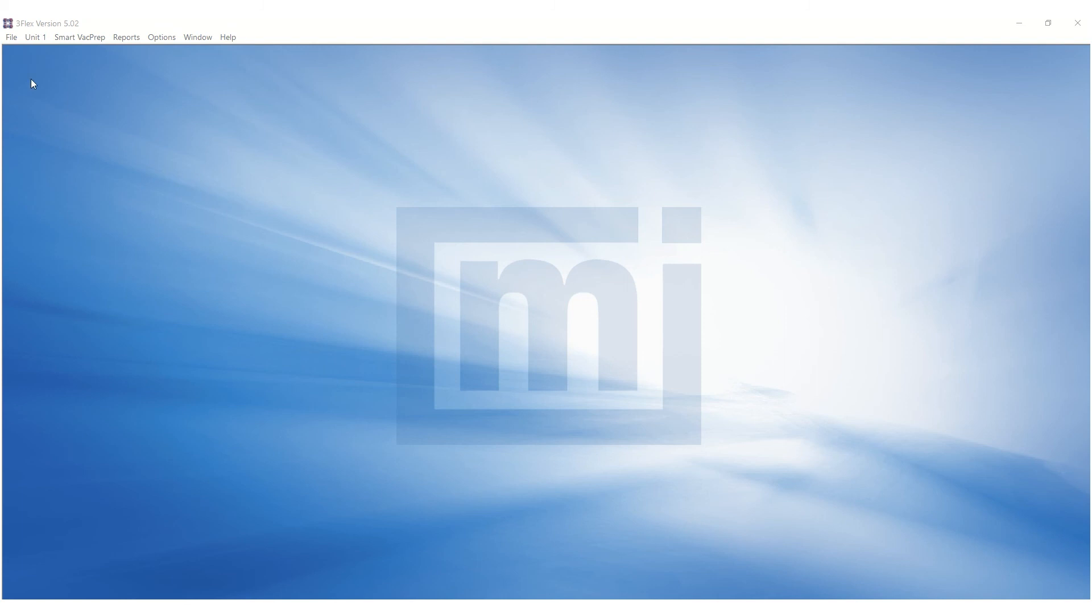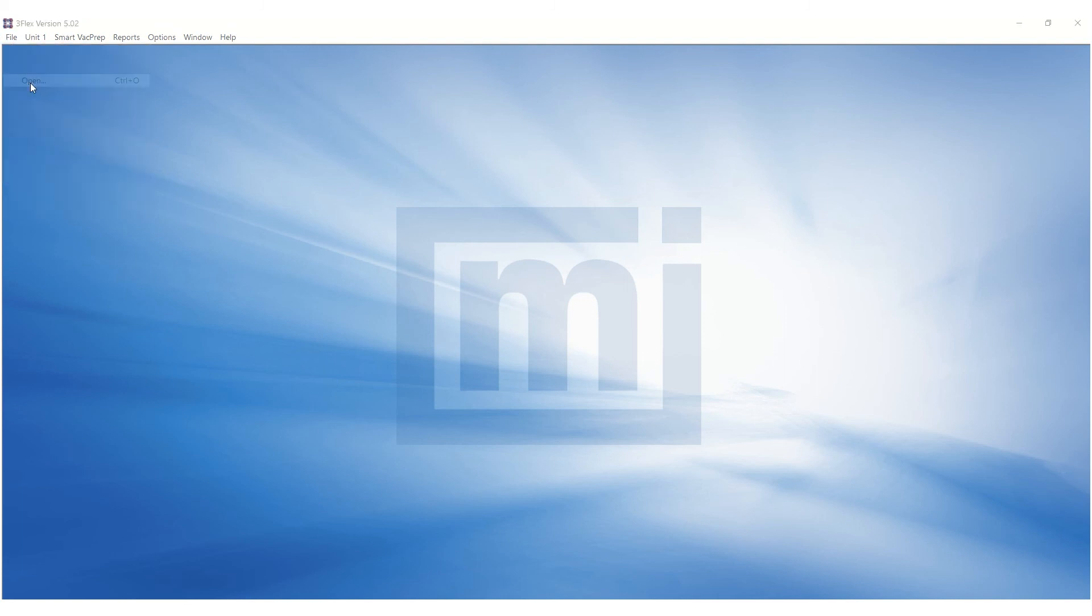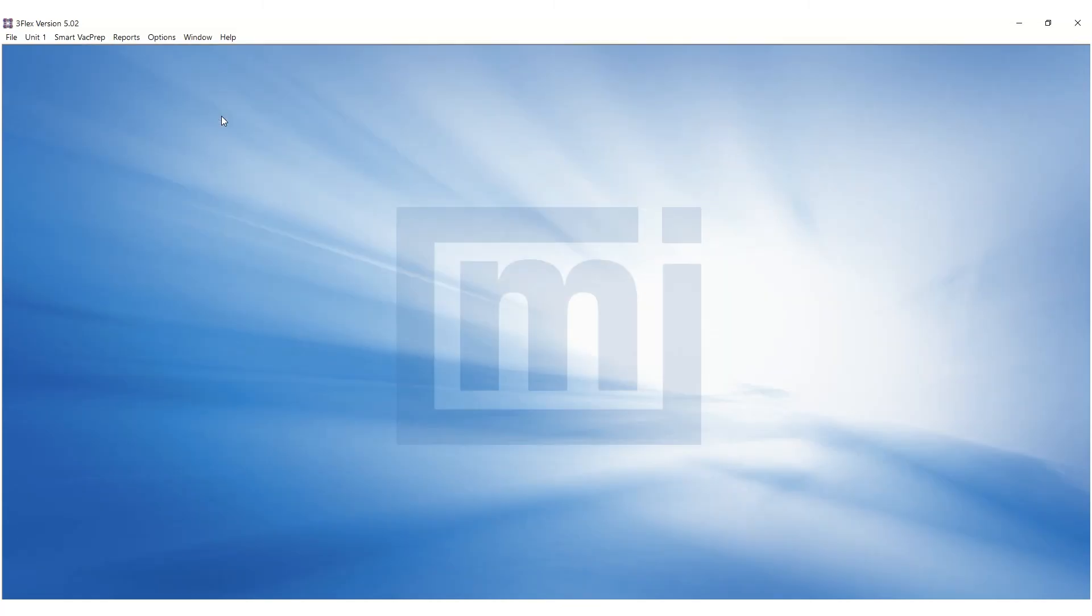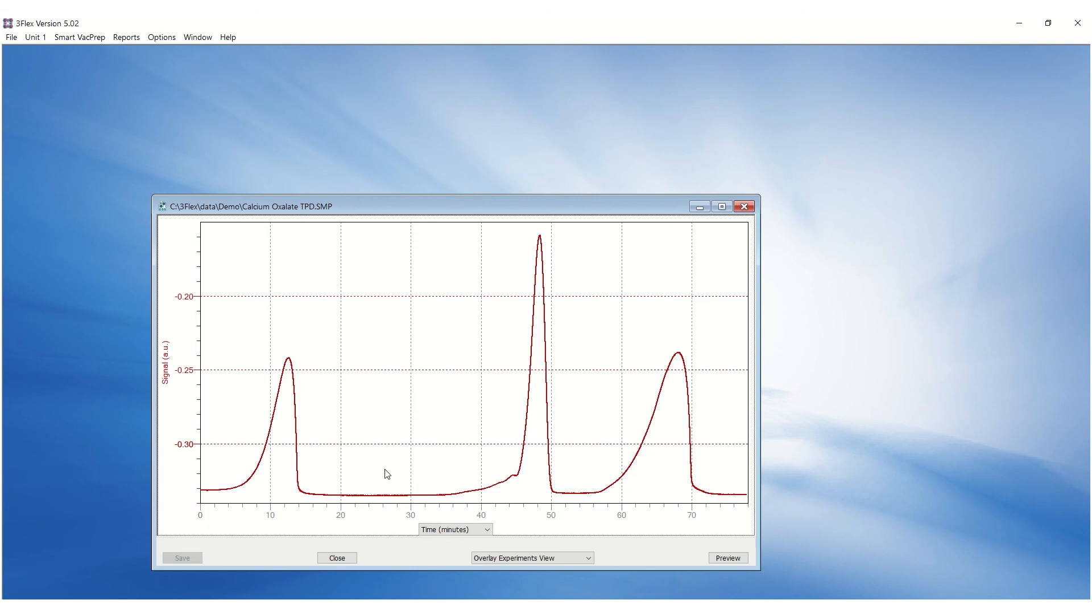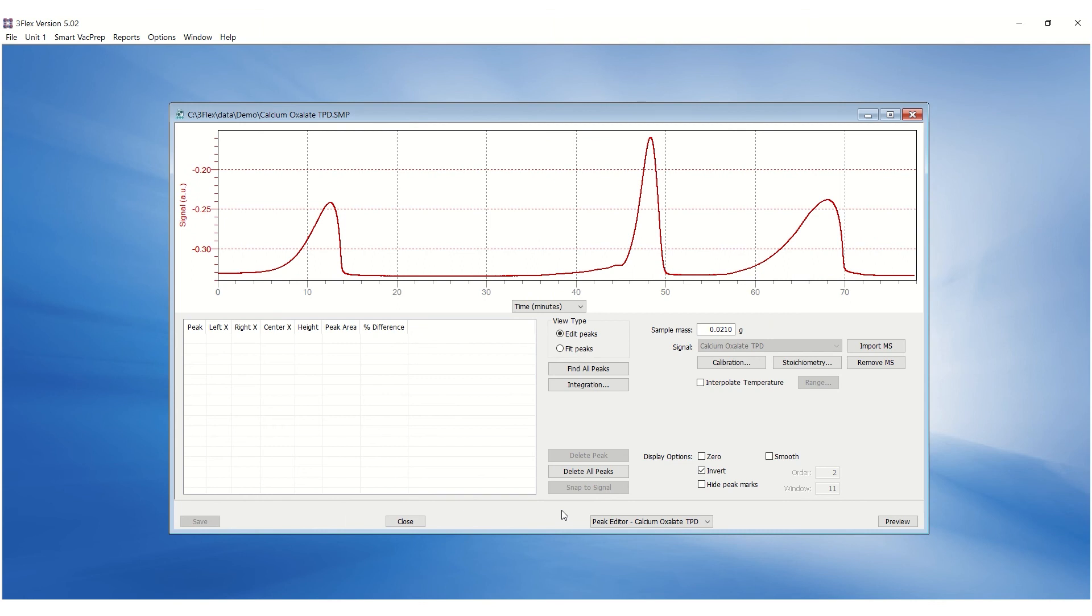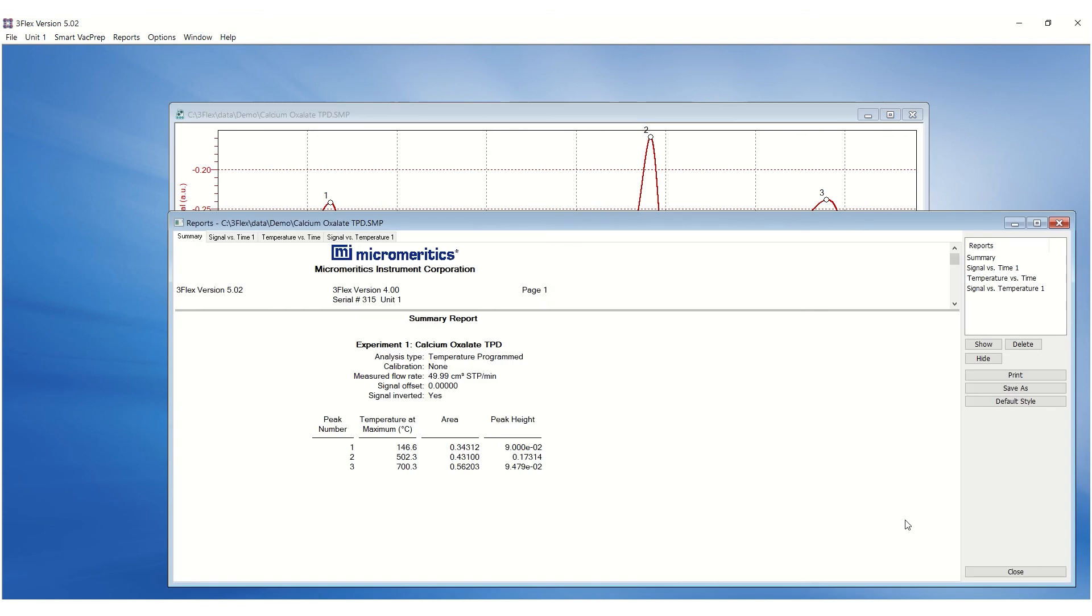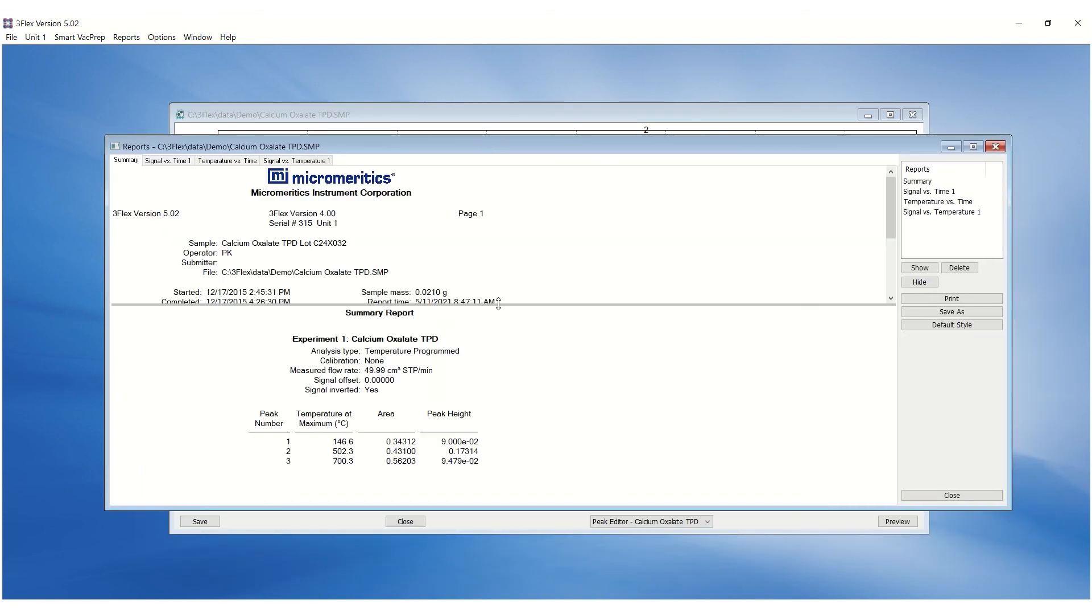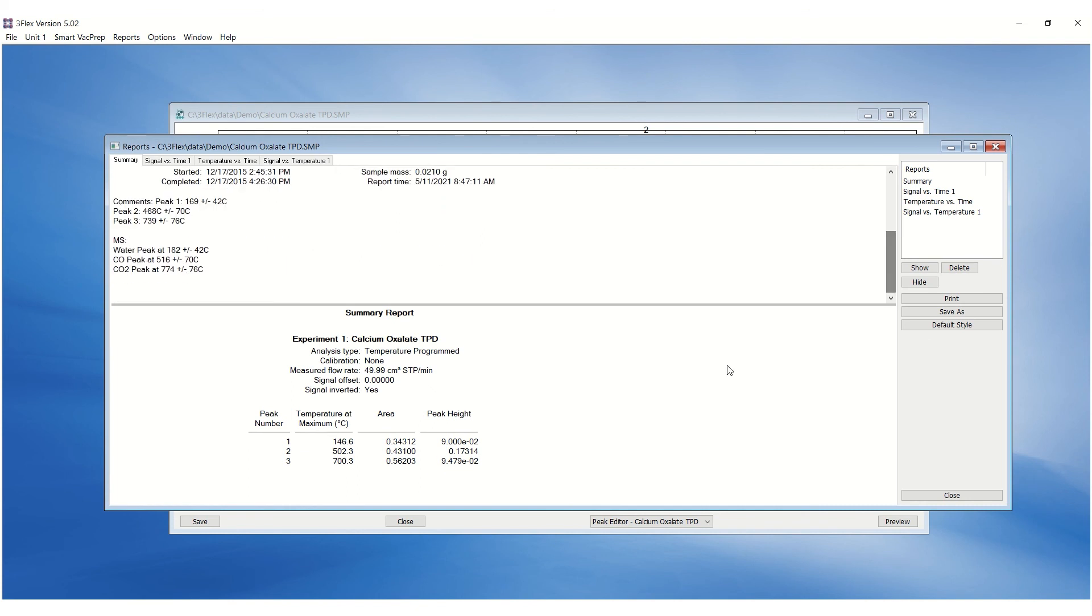Once the analysis is completed, go to the File menu and click on Open to open the sample file. Click on the drop-down menu and select Peak Editor. Click on Find All Peaks and this will automatically select all the peaks. Click on Preview to view the result. Ensure the temperatures are within specifications entered in the Comments section.